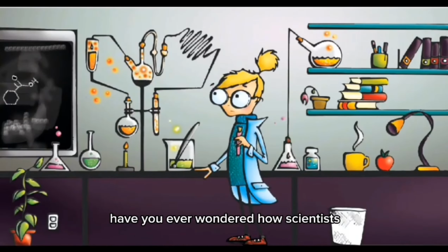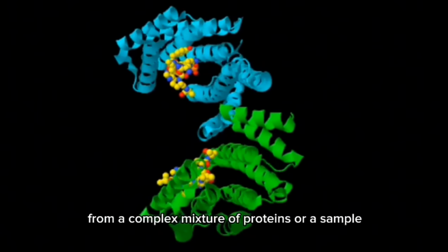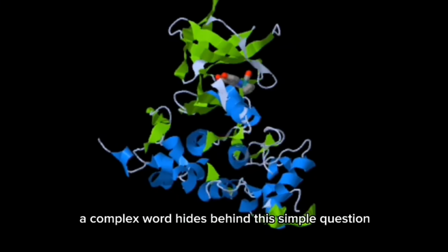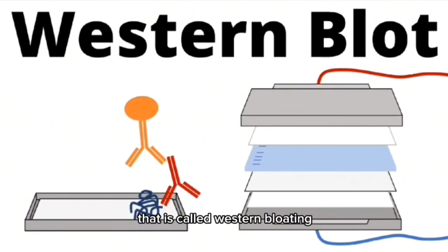Have you ever wondered how scientists detect and identify the specific protein of interest from a complex mixture of proteins or a sample? A complex world hides behind this simple question, and today we are going to unravel one part of it that is called Western blotting.